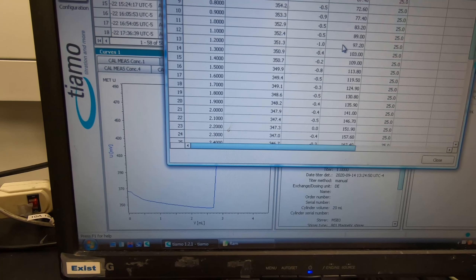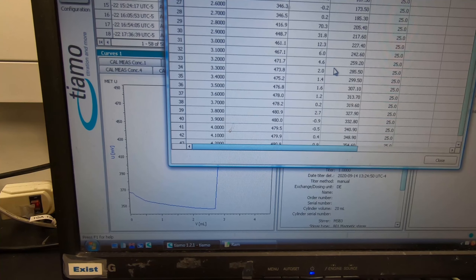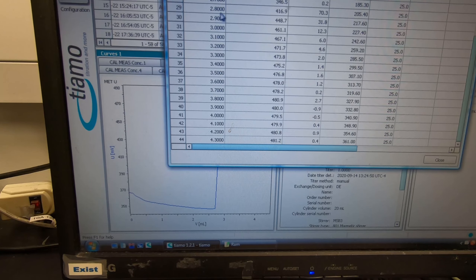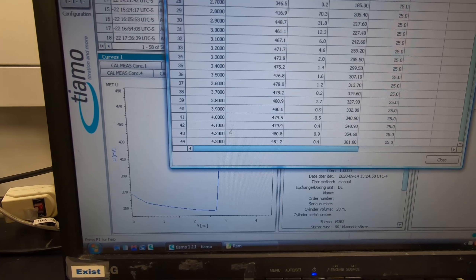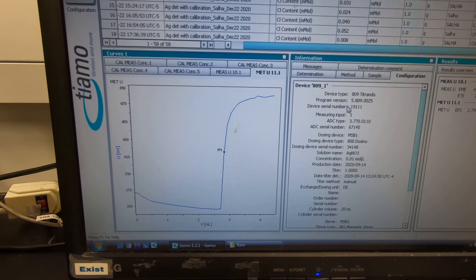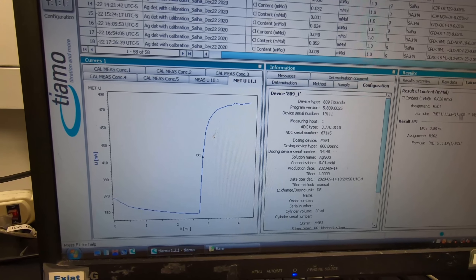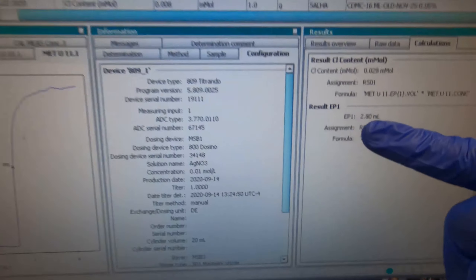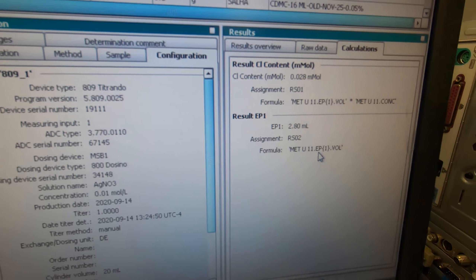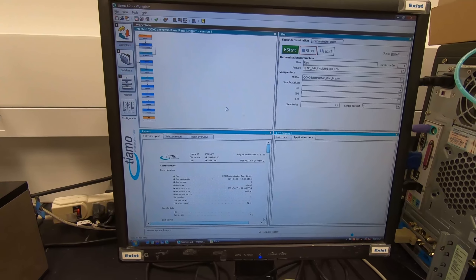If you want to copy this to a spreadsheet, is there a point showing the endpoint? I don't think so - I never tried that because we only need the end point, and it's generated in the report. If you want to see the endpoint in numbers it will show here - 2.8 ml. That's it for a sample test.